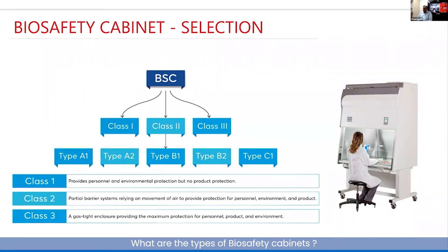Class 2 is a partial barrier system dependent on the movement of air from inside the cabinet. There are different classifications within Class 2 which we'll cover, but it has the capability of protecting the person, the environment, and the product.